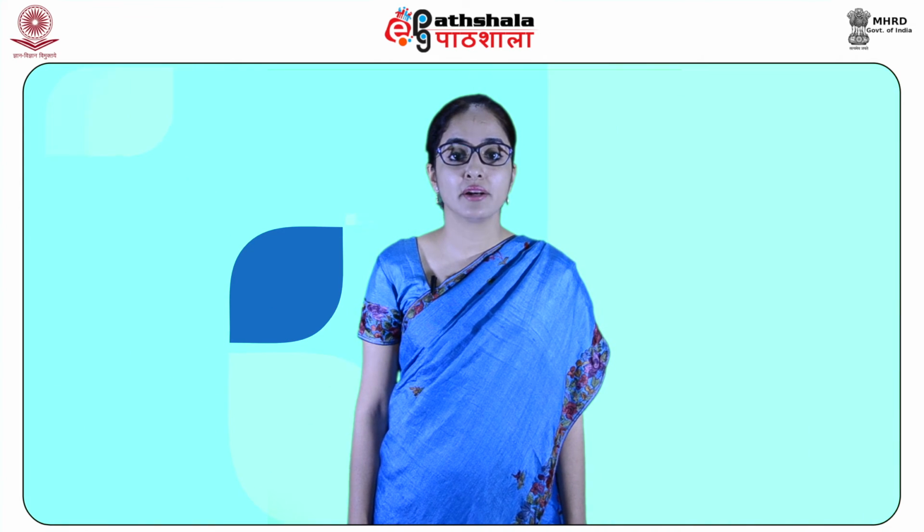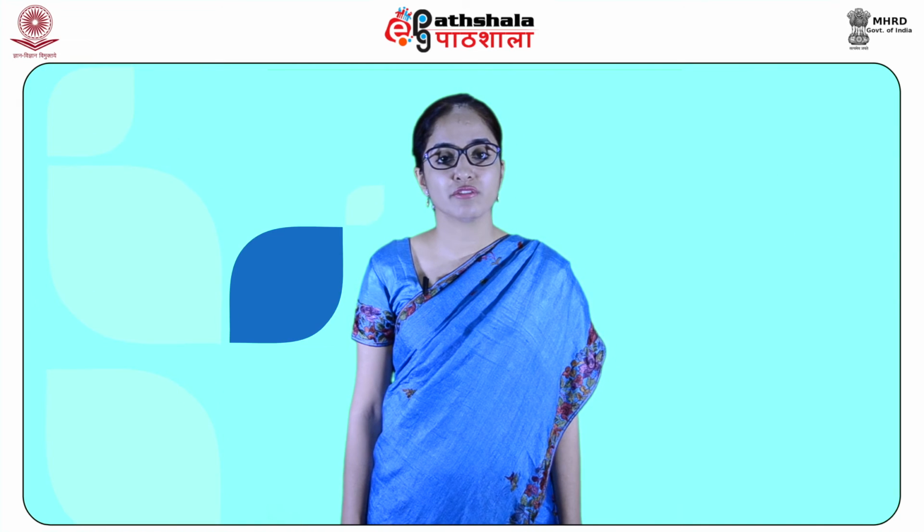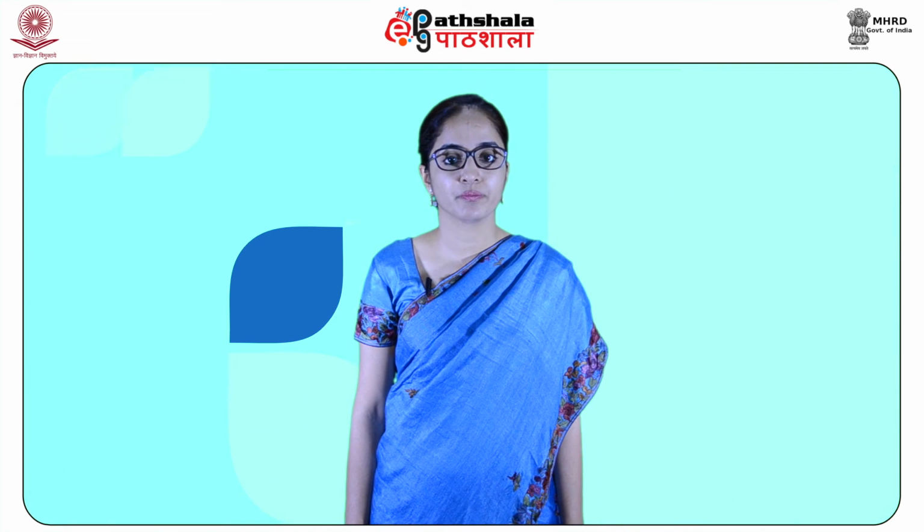It is one of the more routine NMR techniques, as 31 phosphorus has an isotopic abundance of 100% and a relatively high gyromagnetic ratio, which is 40.5% of that of proton.